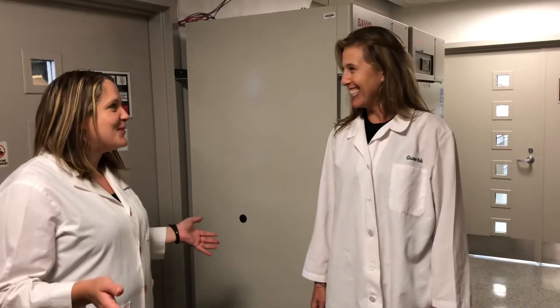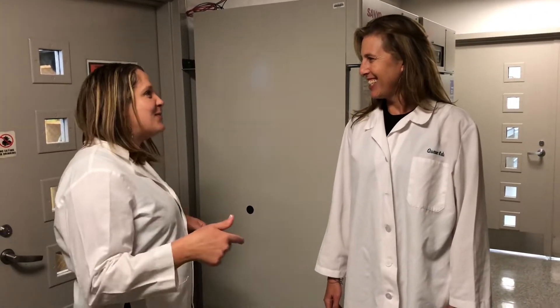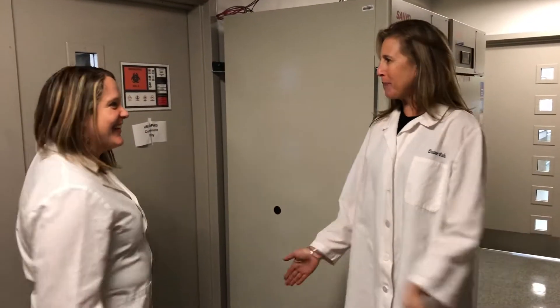I'm so excited that we're back from the field in Italy. I want to show you what we've been doing with the plants since we got back. I'm so excited to see them actually in your lab and see what we're doing with them.